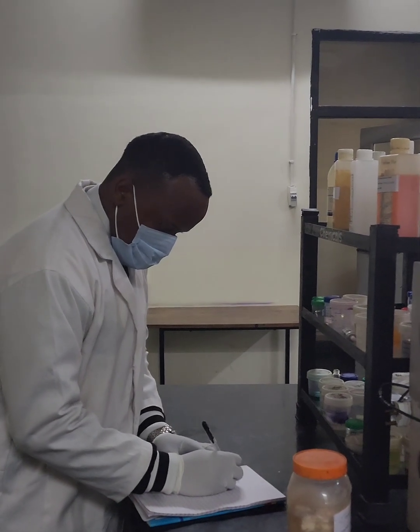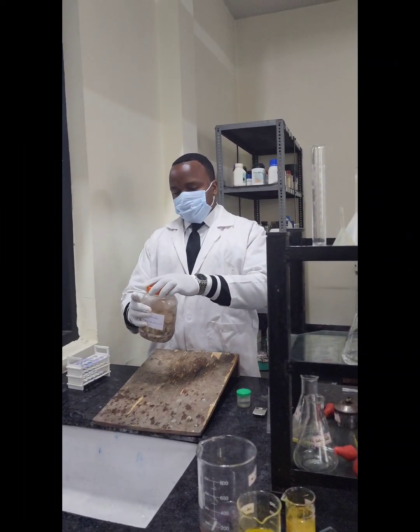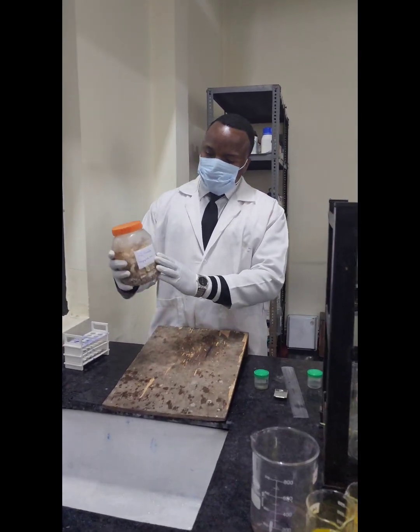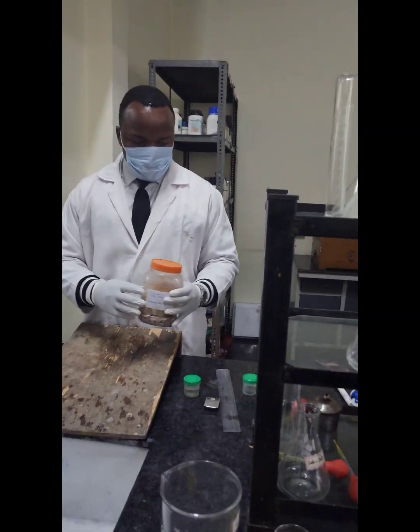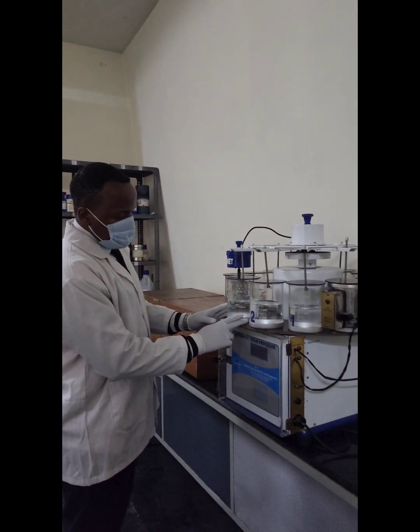Our next step would be grossing, which is the physical or macroscopic examination of the tissue. The tissue would already be in a fixative or a preservative, usually formalin.